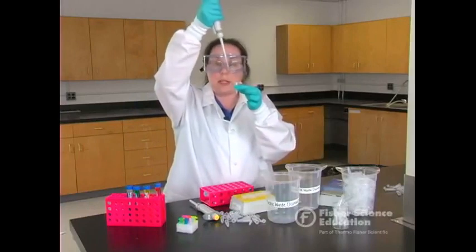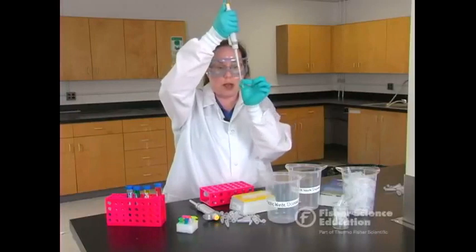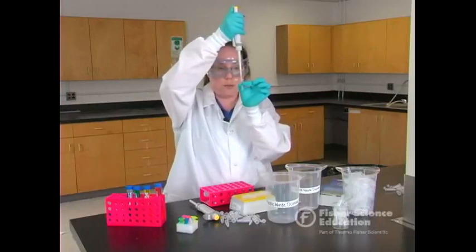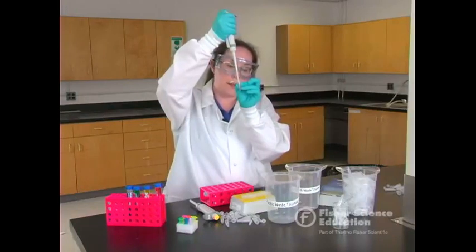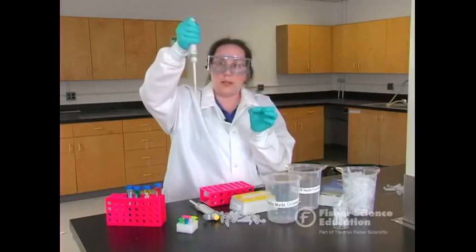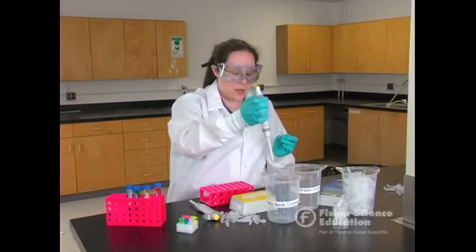Okay, proper dispensing is going to be to the second stop. And in order to dispense properly, you actually want to touch the side of the tube. Slowly go to your first stop. You can see there may be a little bit of liquid left in there. Second stop, keep that plunger depressed. Slowly let go, back up, take your thumb off, and eject. Okay.